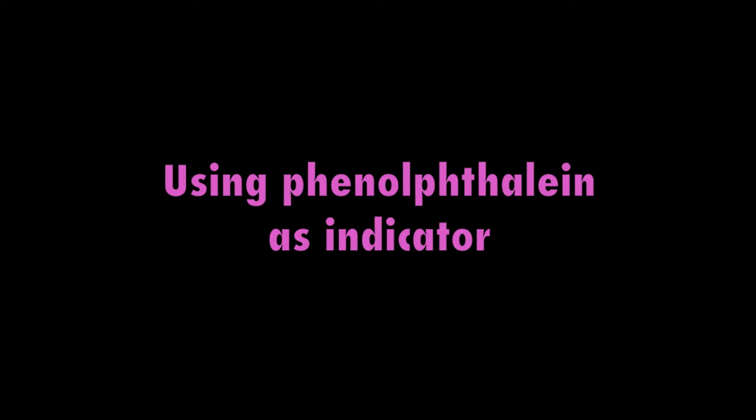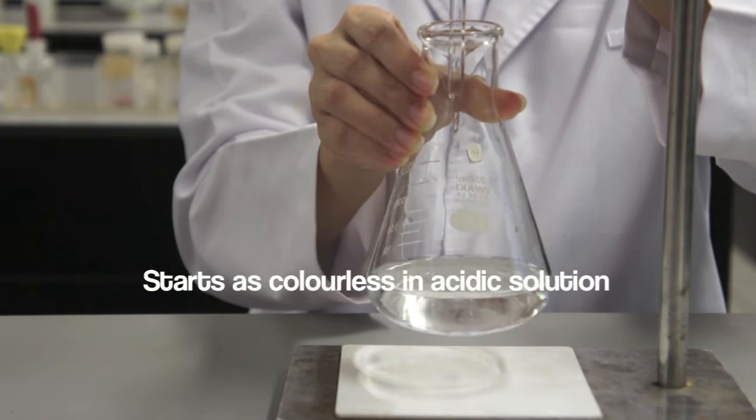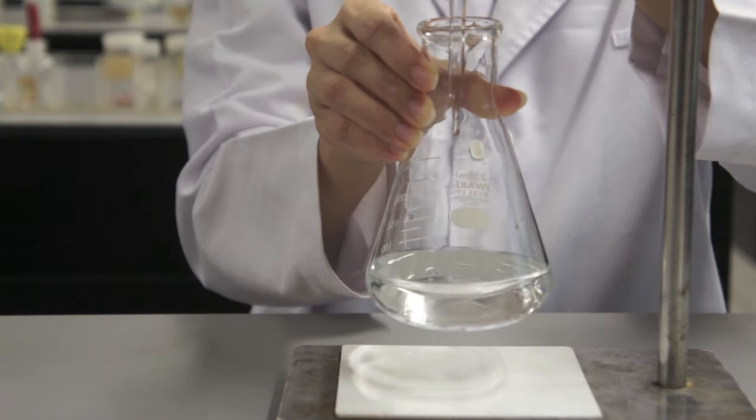This video shows you the endpoint of a titration using phenolphthalein as the indicator. The indicator starts off colorless because the acid is in the conical flask.